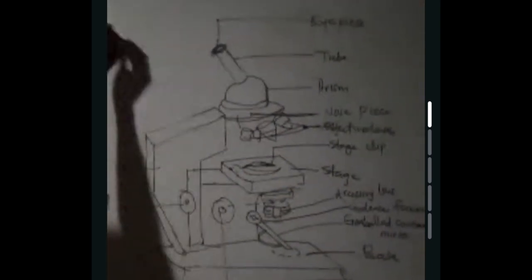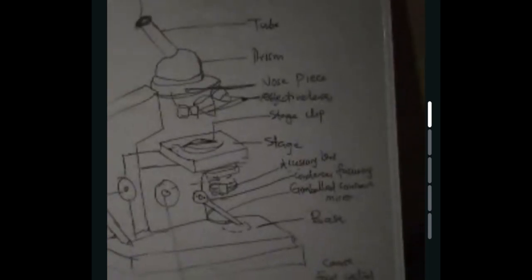The question is going to come. If you put any question down, this is how the answer is going to come. They will not show us the microscope facing this way; this is exactly how the microscope is. So let's note the facts. This is the eyepiece, and the one under the eyepiece is the tube.